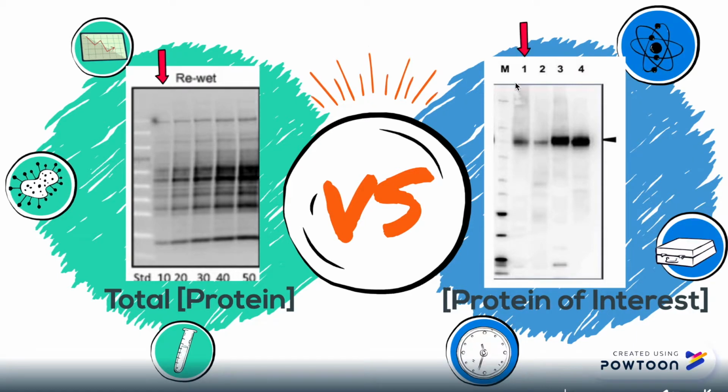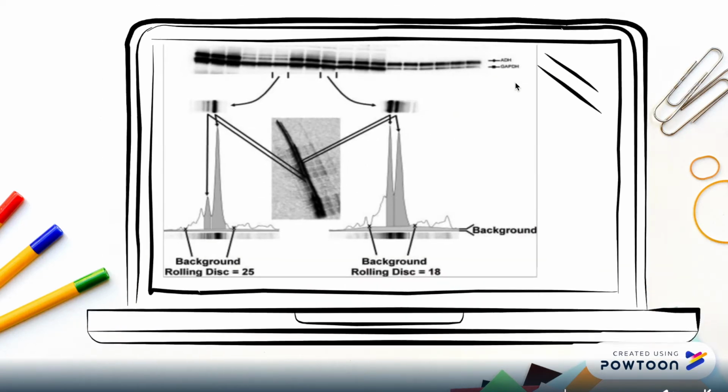So even if we pipette slightly different total protein amounts in each different lane, this variability is accounted for as we're focusing on the ratio between PAKT and the total protein within the same lane. Density is proportional to protein concentration, so we can use the two blots to find the amounts of PAKT and total protein by comparing their densities.